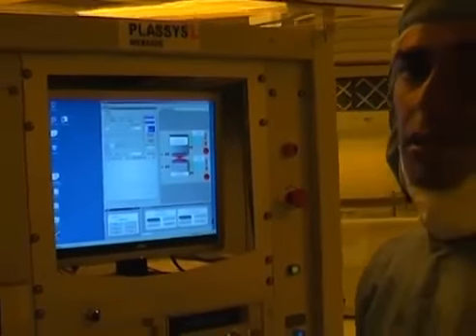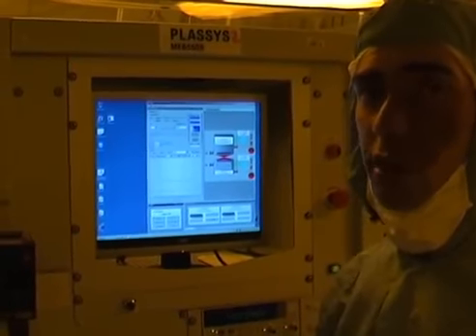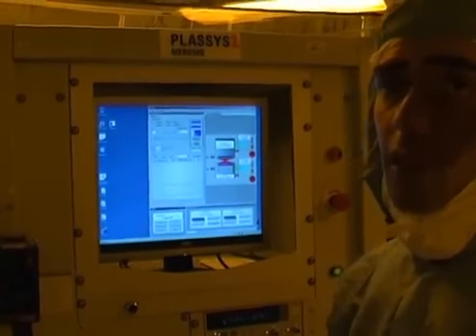And in case the machine gives an error or you are in need of assistance, just contact a member of technical staff and they will help you.